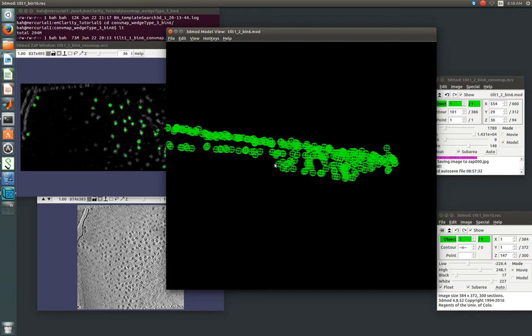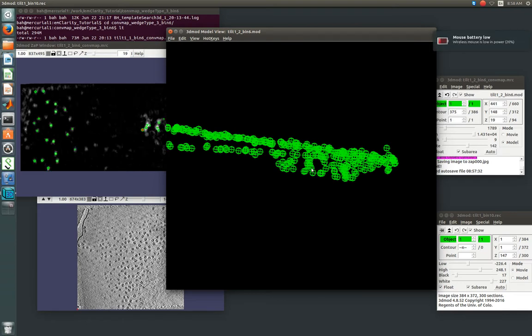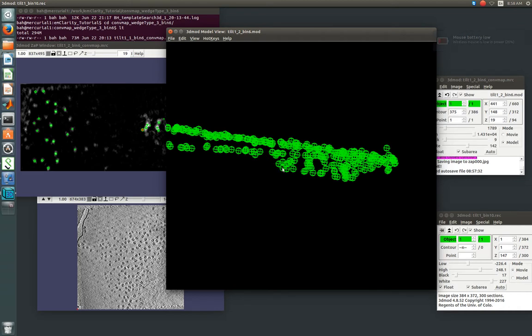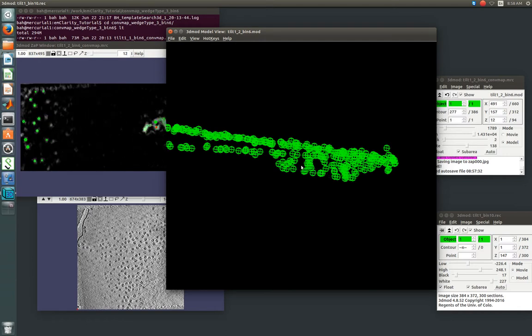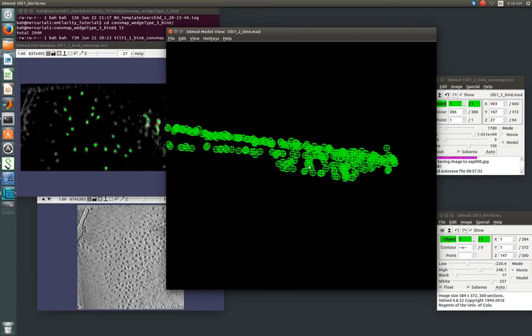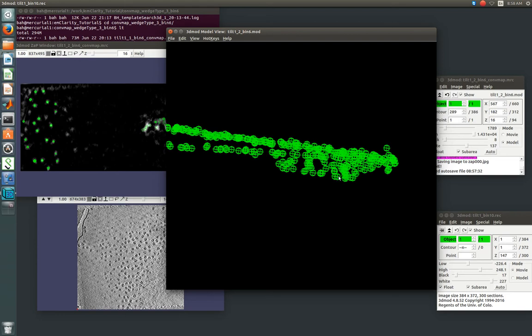So, you can't just start deleting things. You always want to click once with the right mouse button, and then from there you can hold CTRL, dragging the mouse button over multiple points.